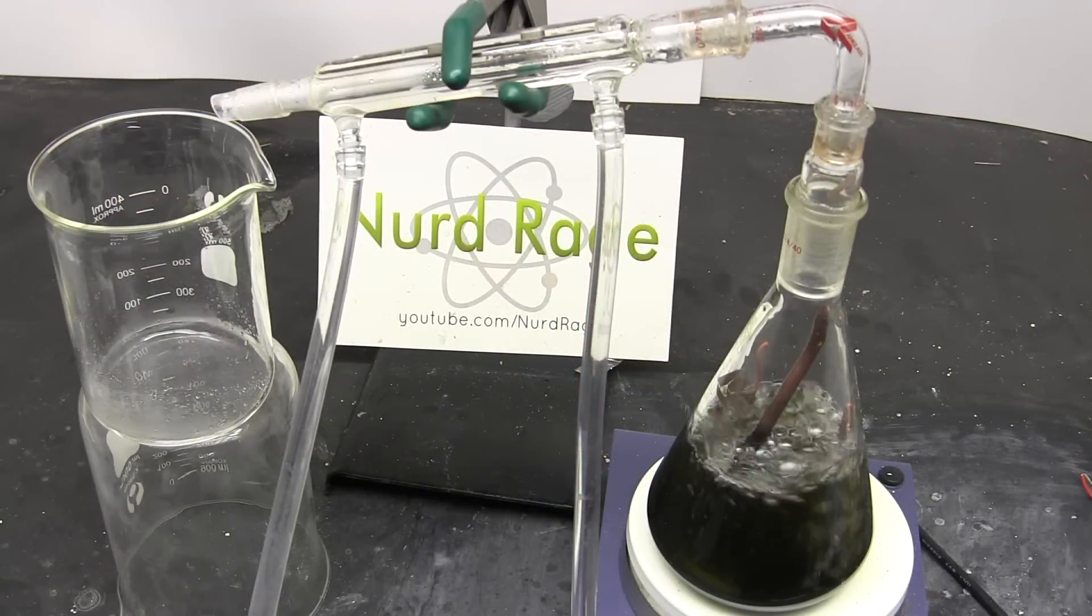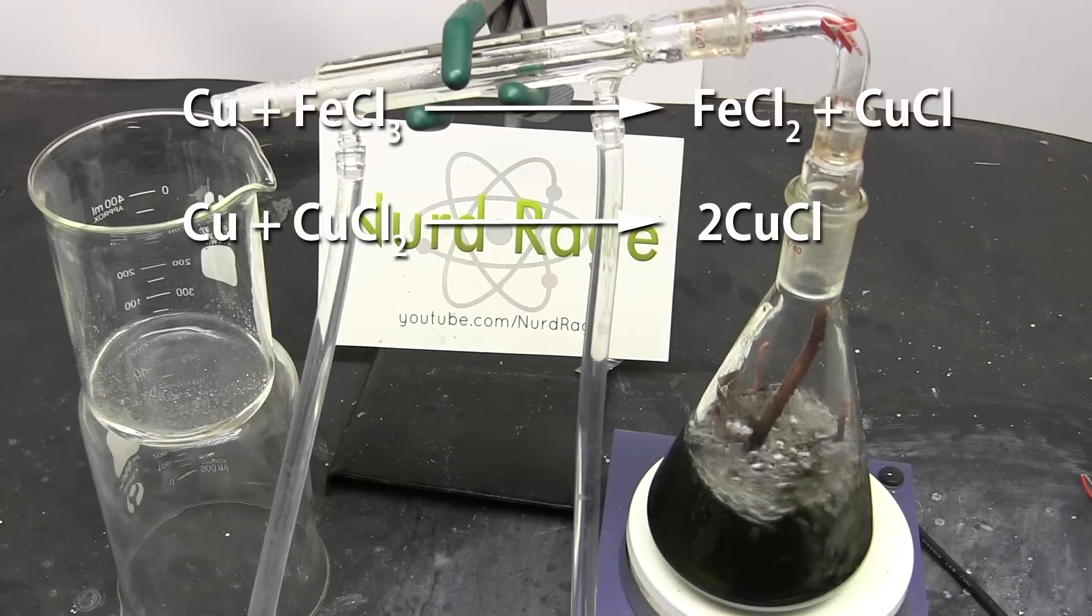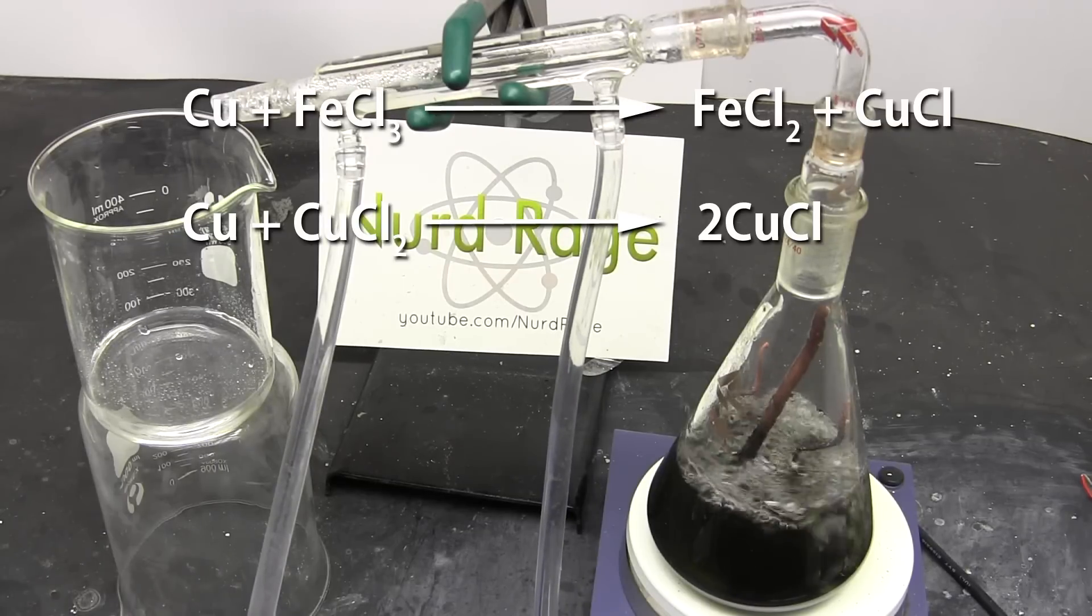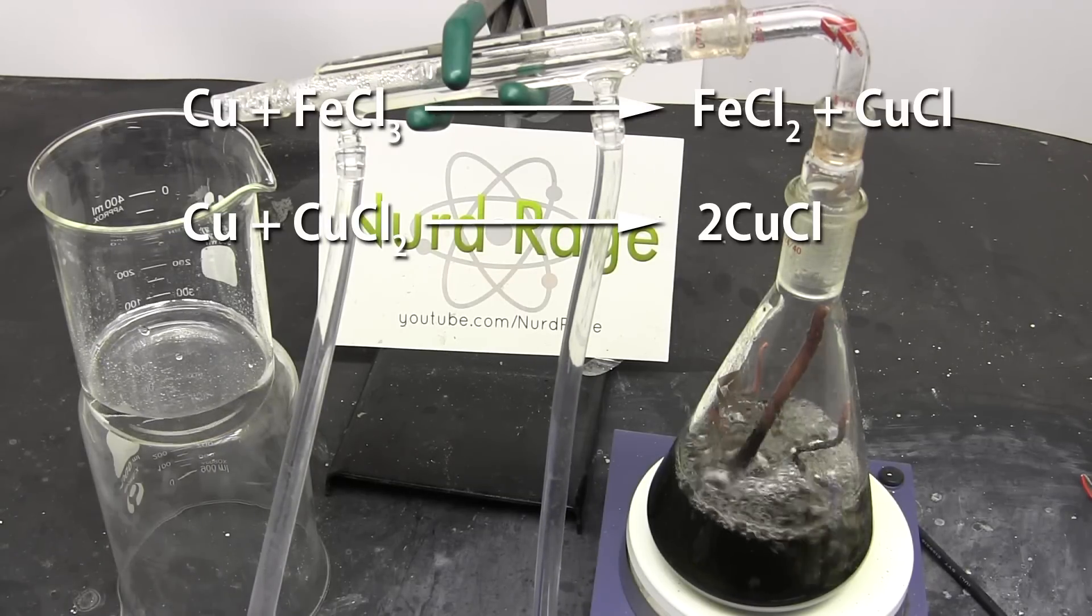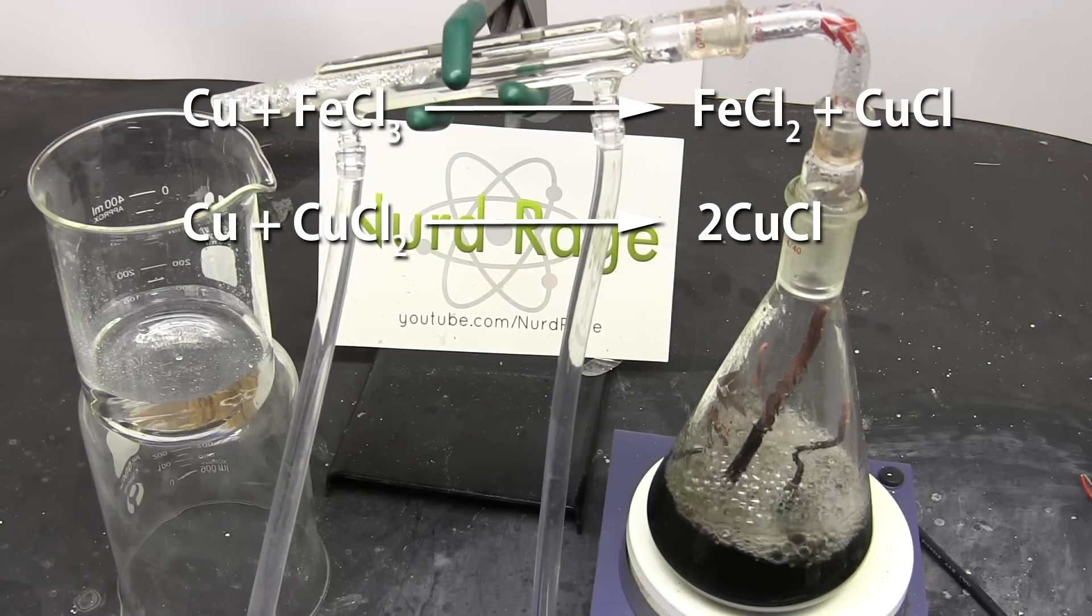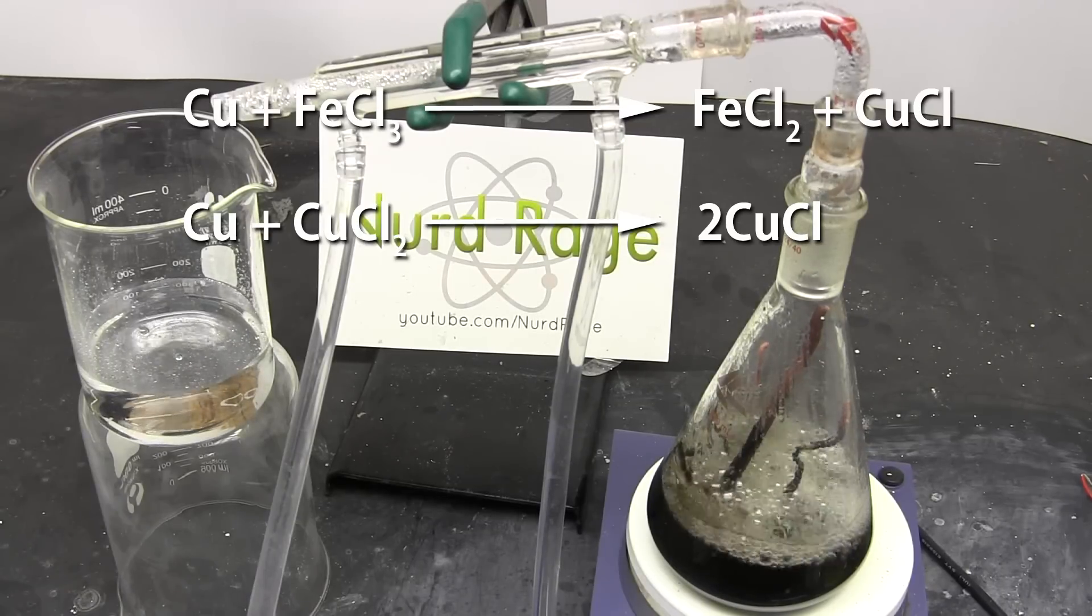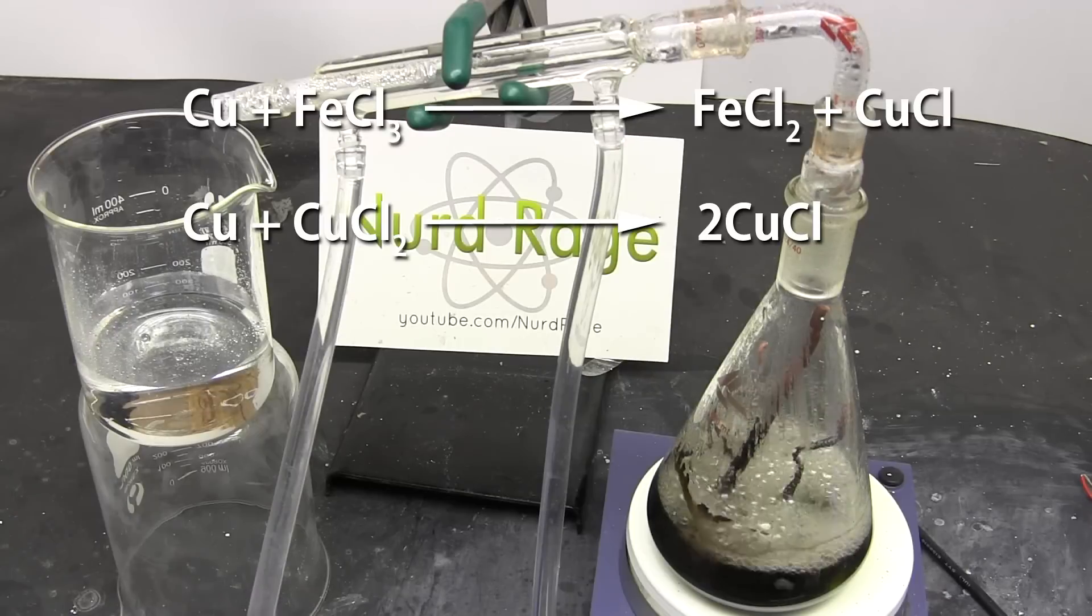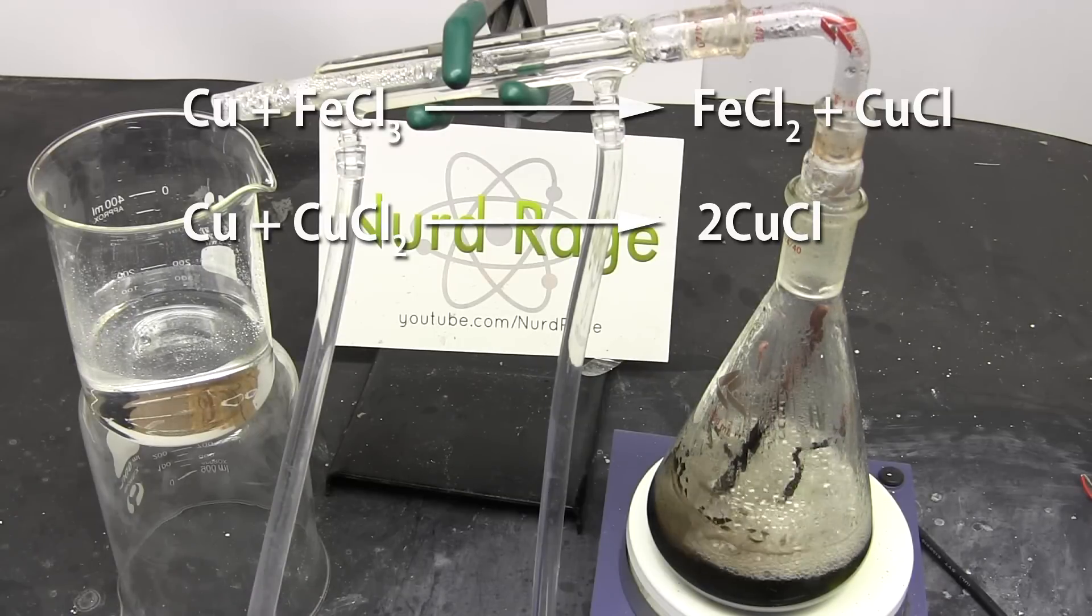Okay now we distill the mixture again but this time the added copper will react with the ferric chloride and copper chlorides to produce ferrous chloride and copper chloride. These are also known as iron 2 chloride and copper 1 chloride. We're doing this because while iron 2 chloride is soluble in water, copper 1 chloride is not and that gives us our means to separate the two.